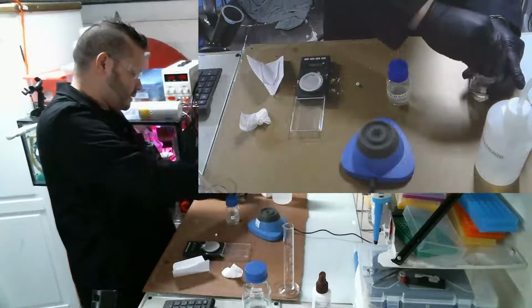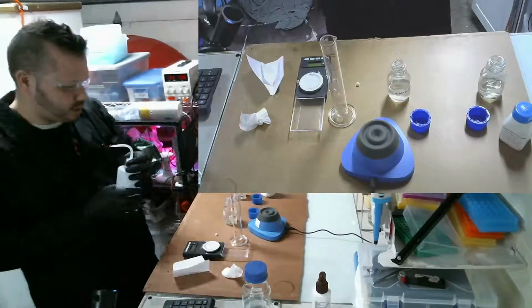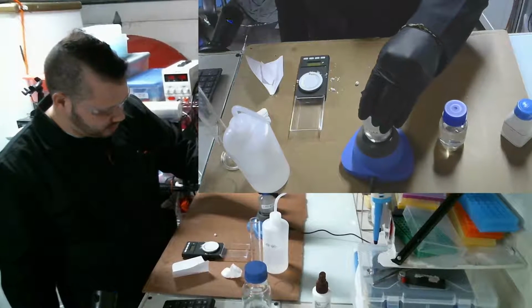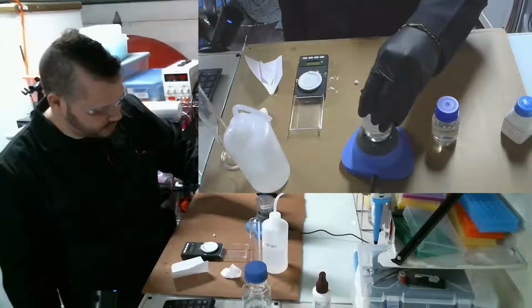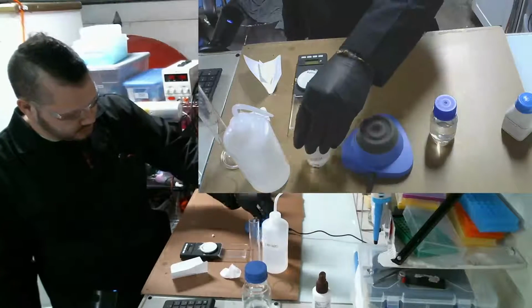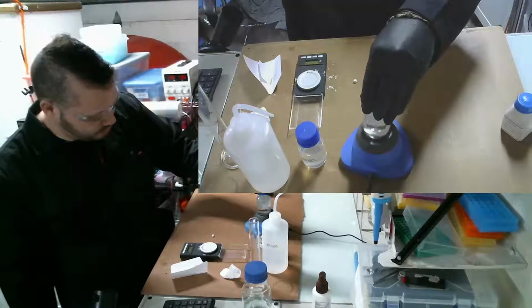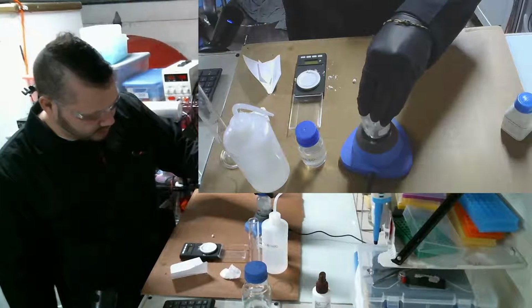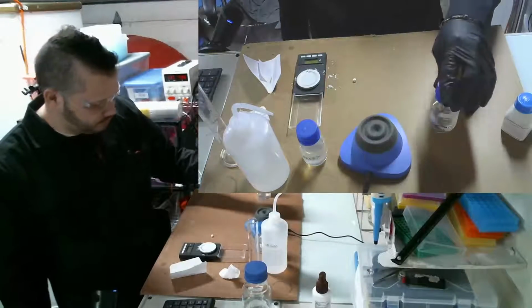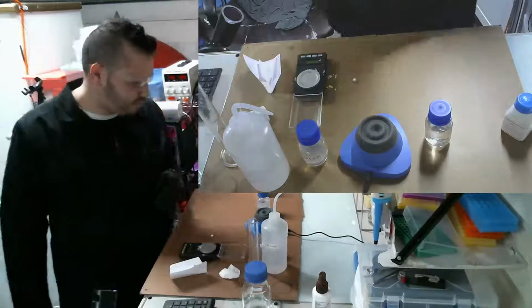Now what I've got to do is add 25 milliliters of distilled water. Mix these again. Now this is the indole acetic acid, or the naphthaleneacetic acid. And then this one is the control, just sodium hydroxide. Essentially all I did was dilute it in half. Perfect. So that's it for this video.